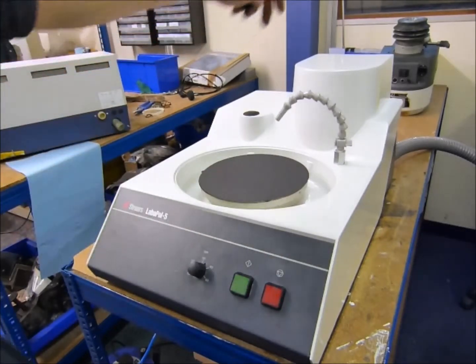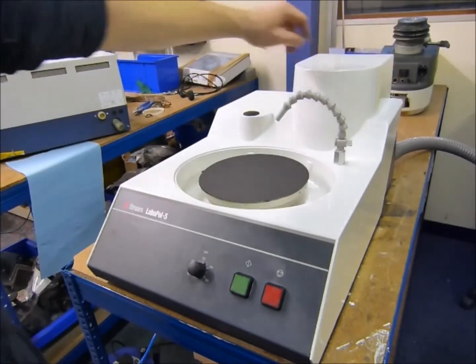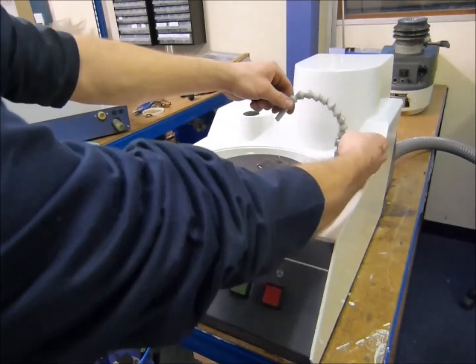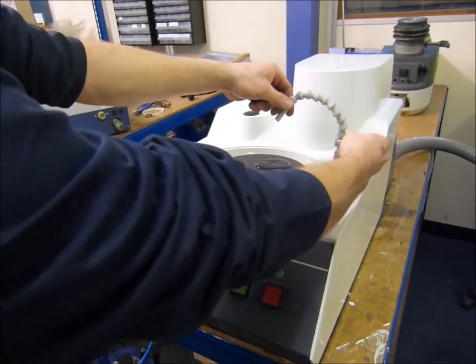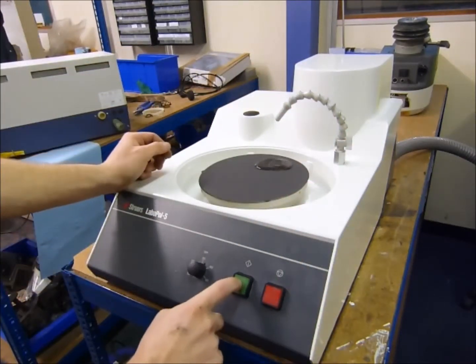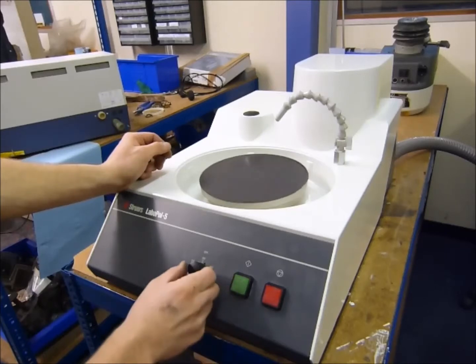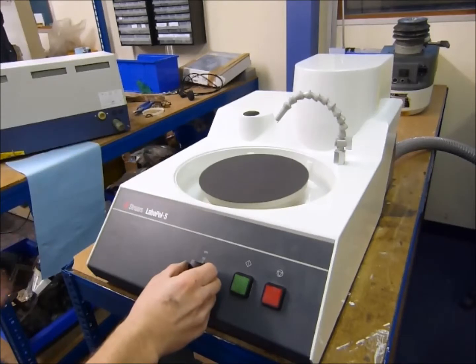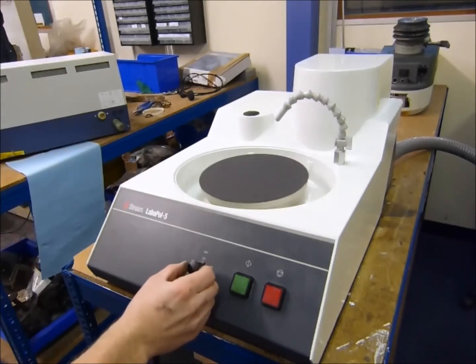Once you've got your water turned on and your waste pipe connected, you can set your water speed and then push the green button. You can adjust the speed — I've got it set to just over 300 rpm.